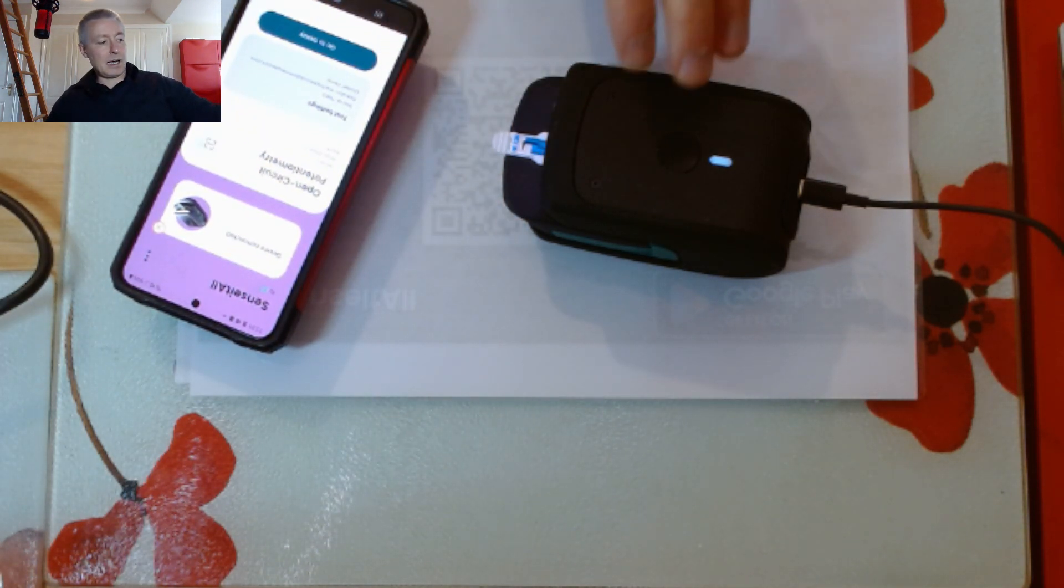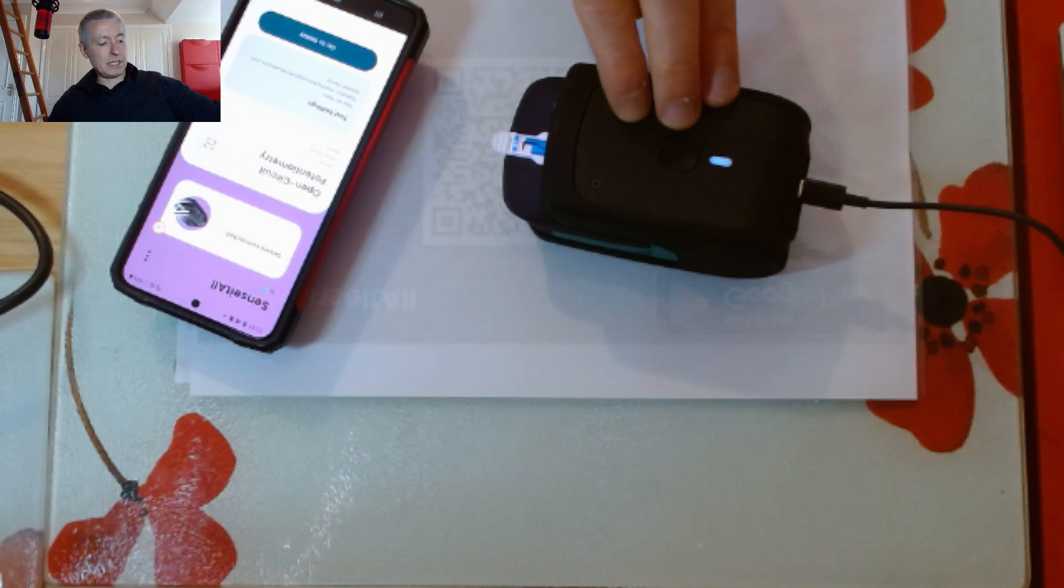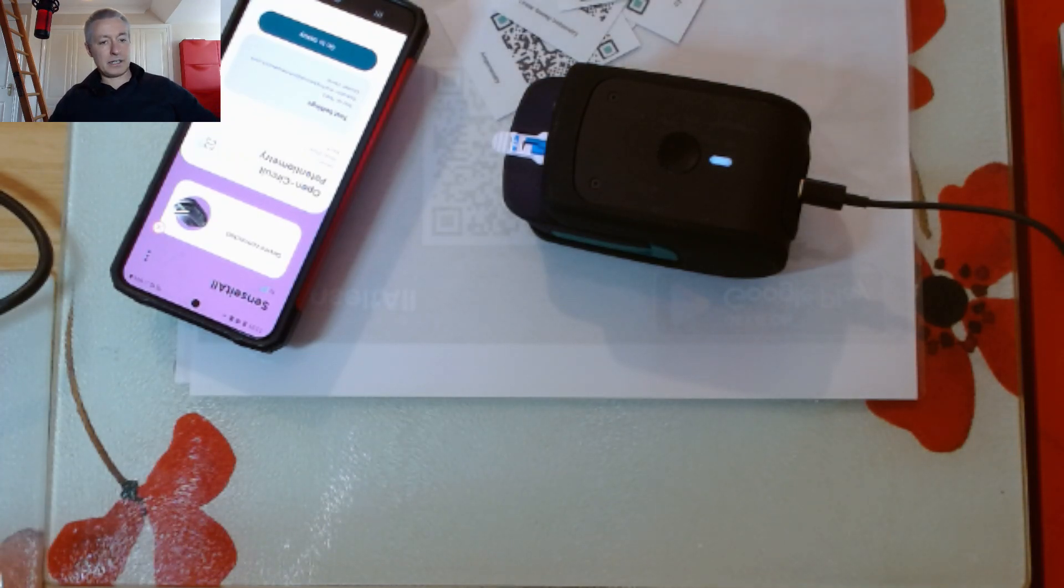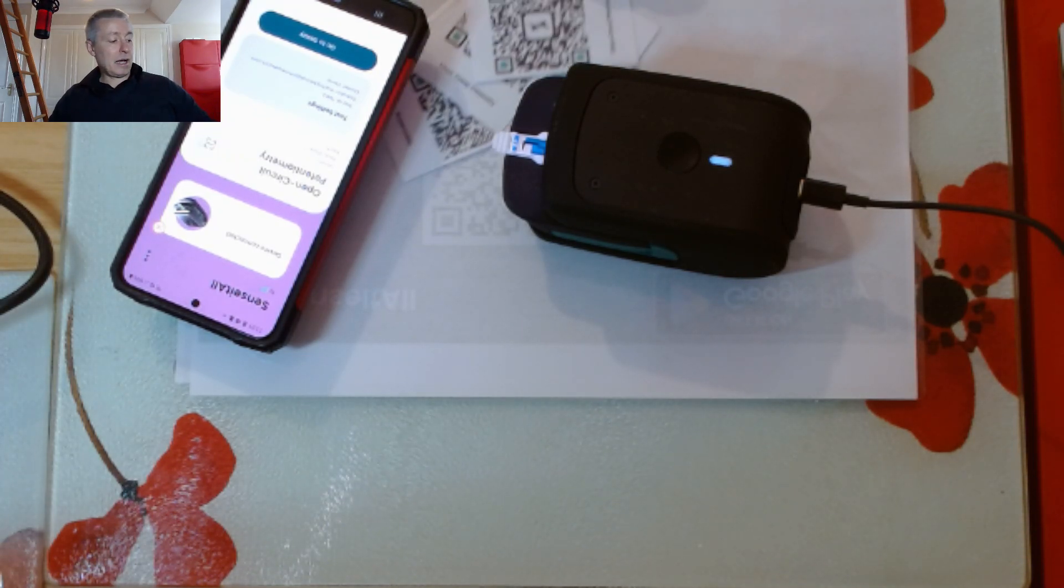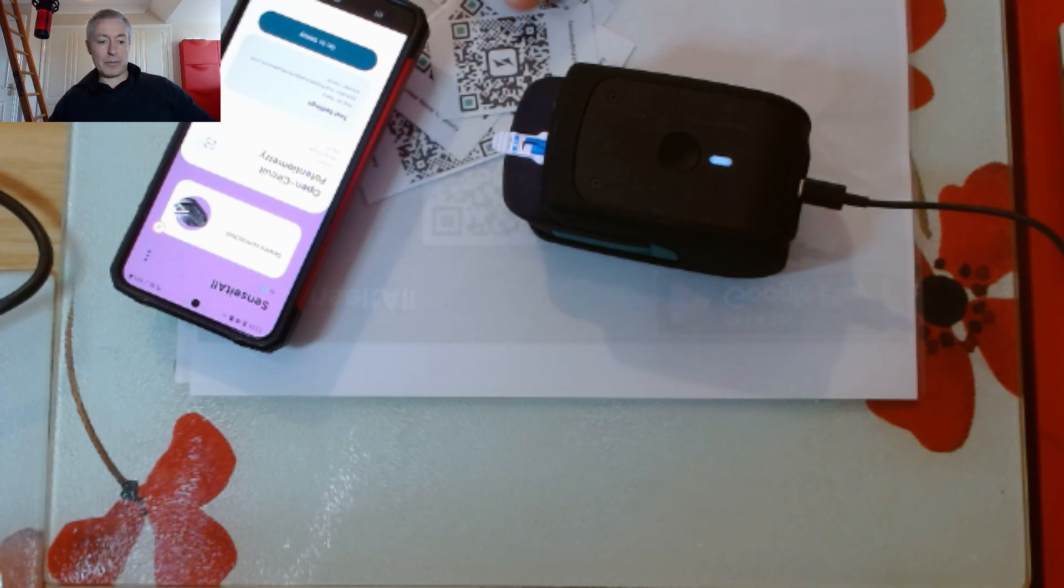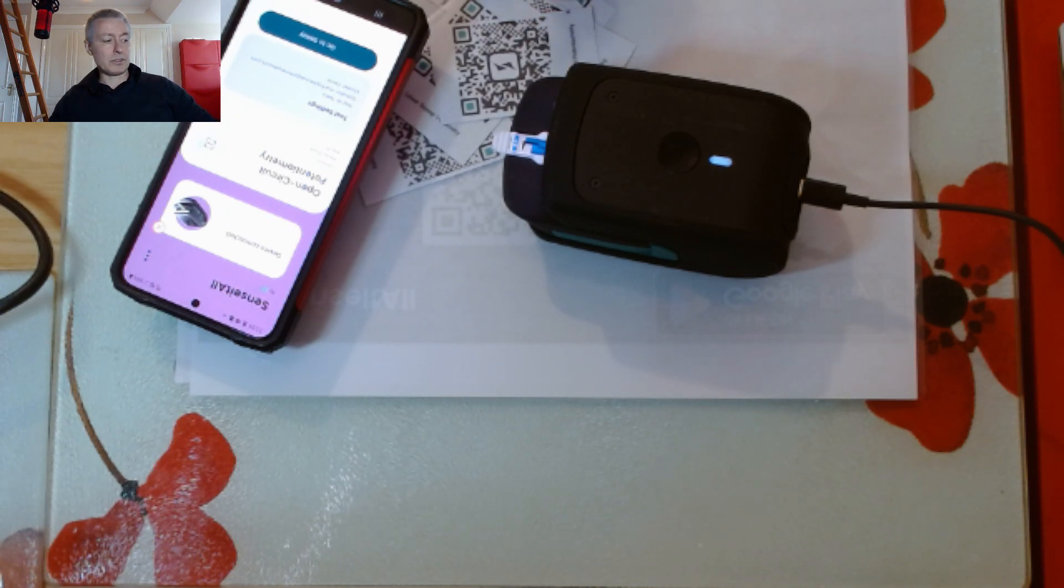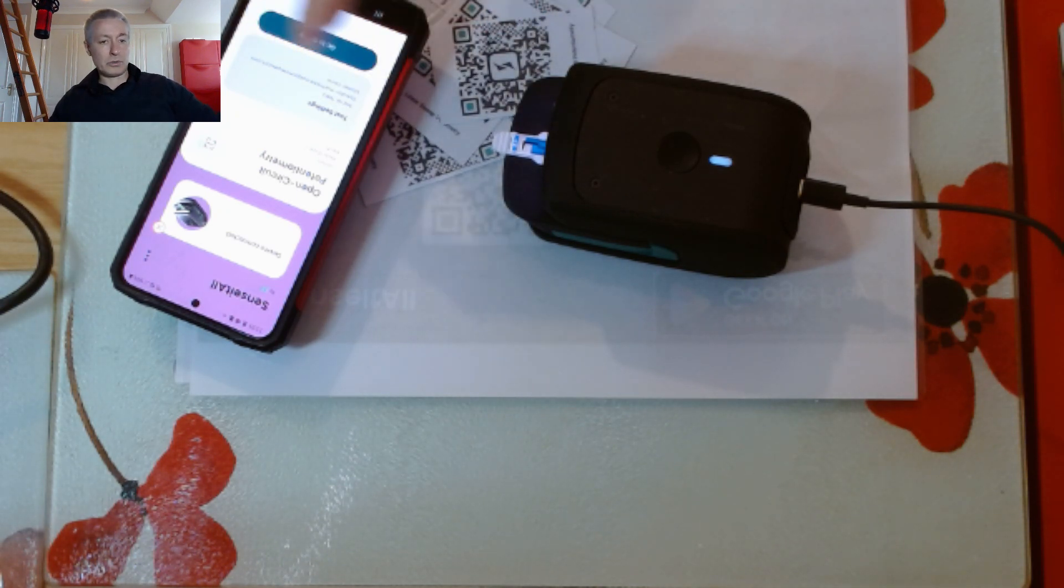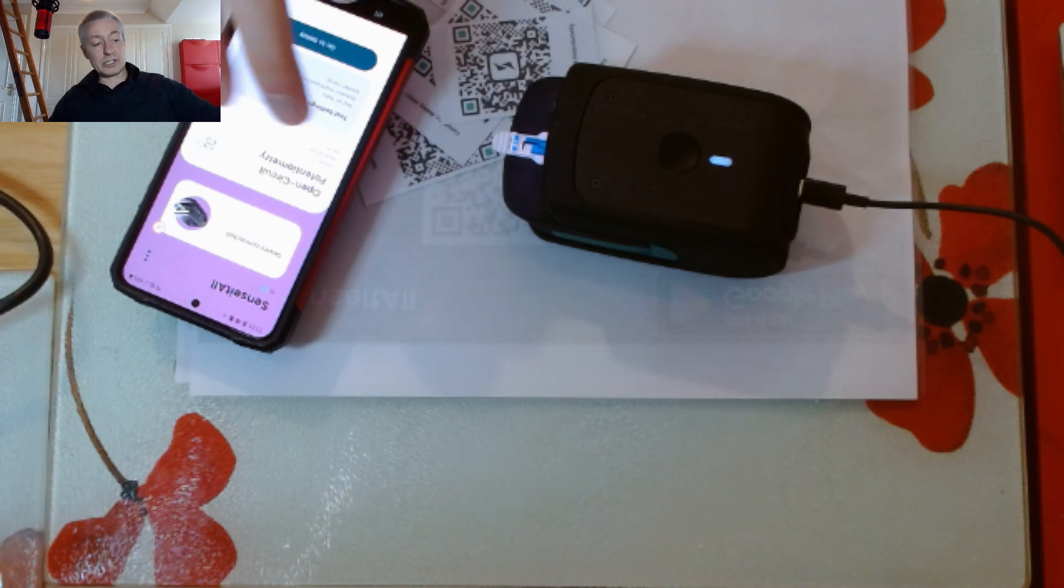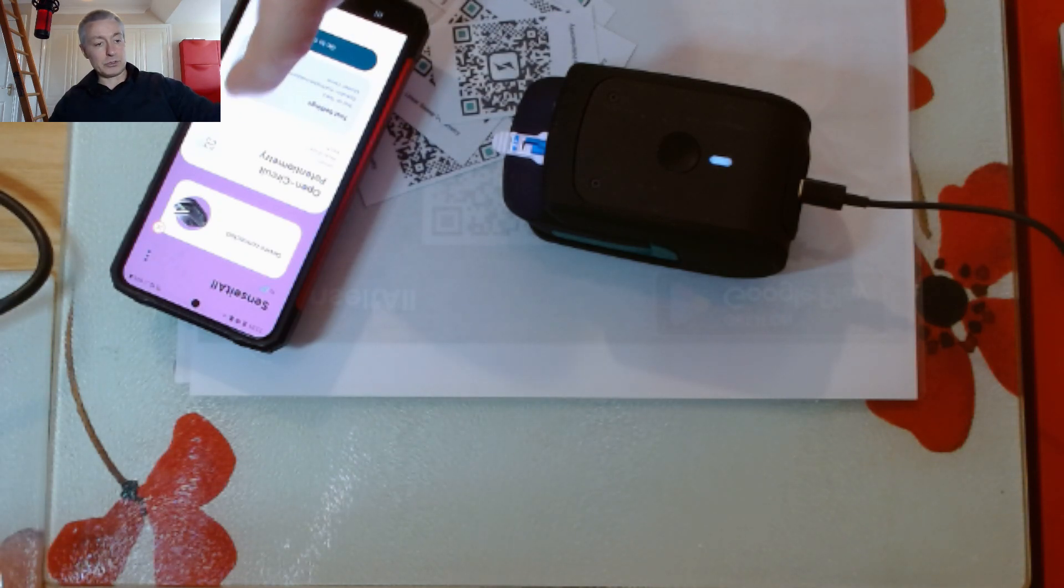This little potentiostat can do many of the classic electrochemical methods, and you can just change the technique at any time by using a QR code. That will tell the app what to do, and the app will tell the hardware what to do.